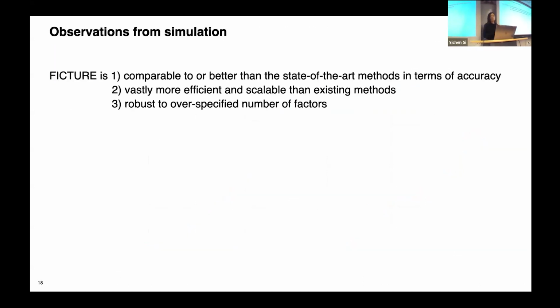So to summarize observations from the simulation, we achieve comparable or better accuracy than the state-of-the-art method. Our FICTURE is vastly more efficient and scalable than existing methods, and it seems to be robust to over-specified number of clusters.